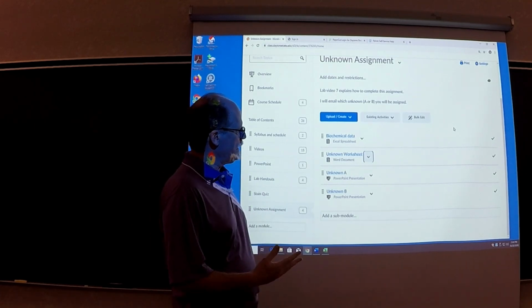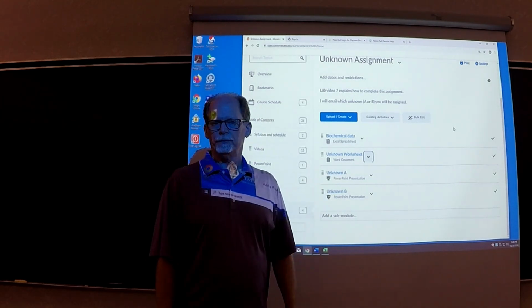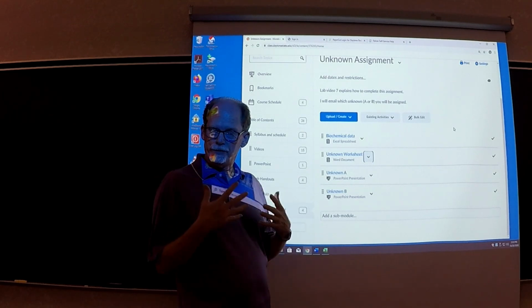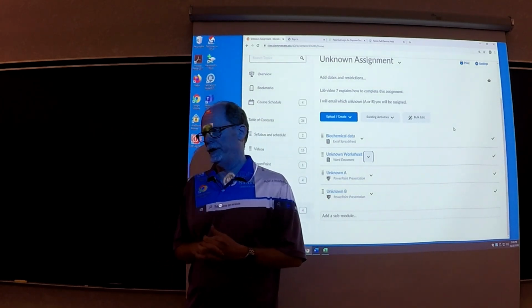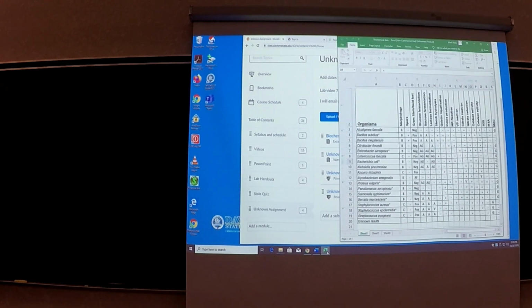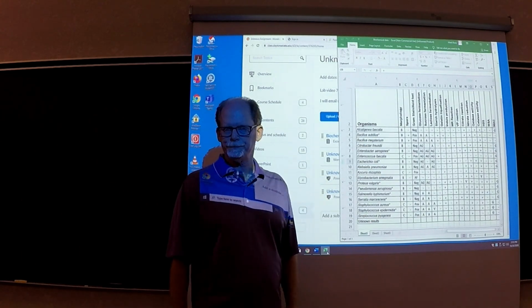You're supposed to identify what your bacteria is by looking at the results for different biochemical tests that are on these PowerPoint presentations. You're going to decide what your unknown is. So, for instance, this is a list of bacteria that your unknown can be.